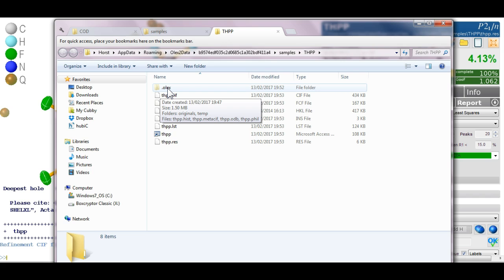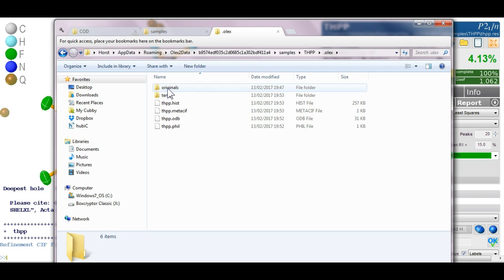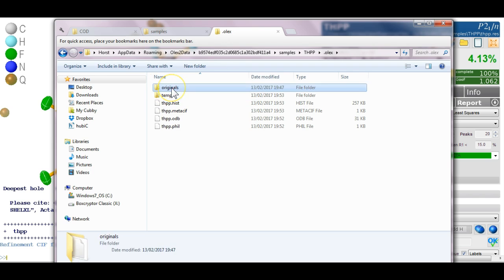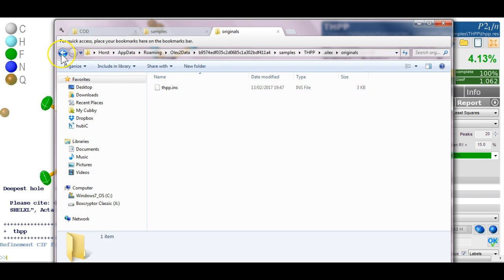So you can change that and make it visible. Now in this folder there is first of all a folder called originals and that contains the very first file that Olex 2 has ever seen about the structure. This is a bit of insurance if something goes majorly wrong you can always go back to that.